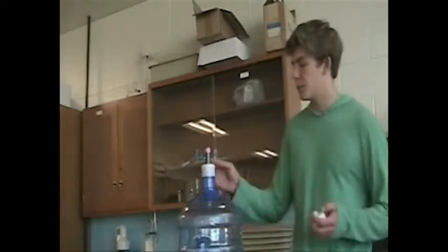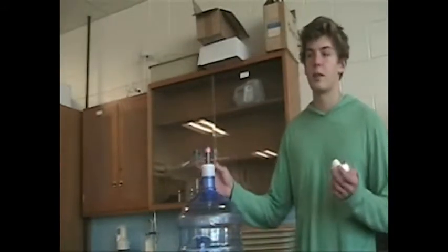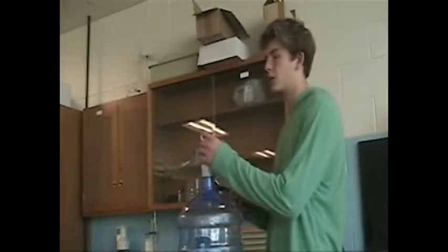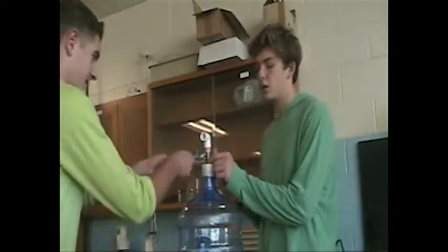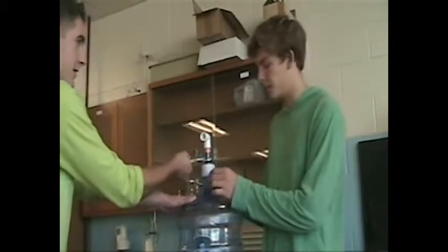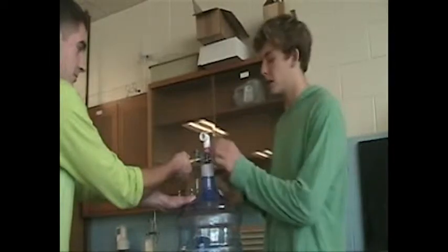Alright, so right here we put some plumber's tape on this to make sure that it remains watertight throughout the entire system. And then right here, Noah's going to help me put this on. He's going to hold this piece so that we don't apply any torque to the glue drying inside, so we don't mess it up.